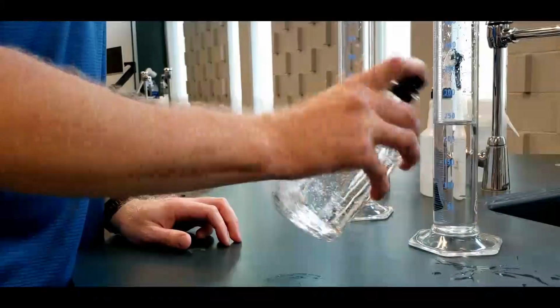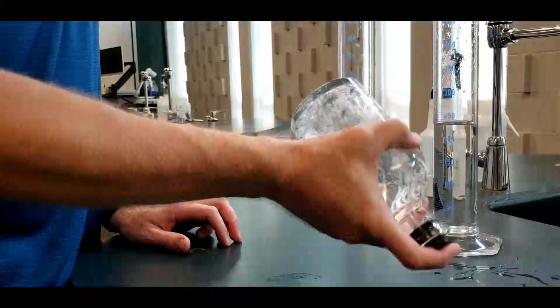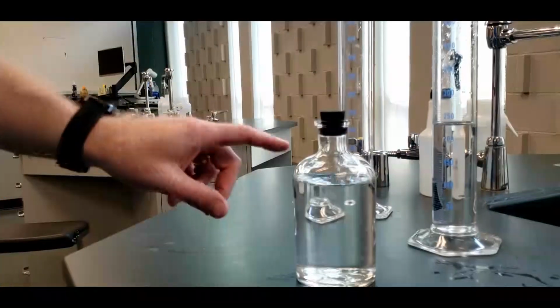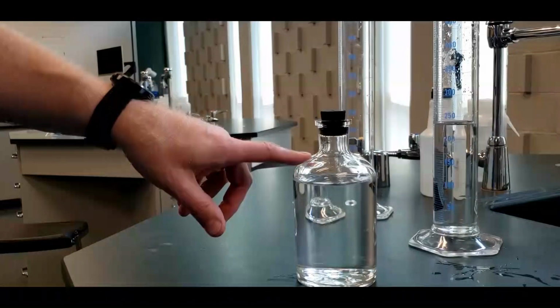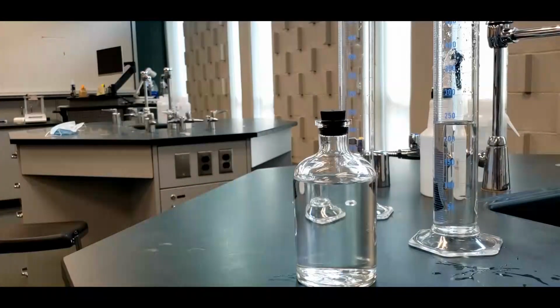You don't shake it like a bartender shaking up a drink here. You just need to mix it. That should about do it, and that should be perfect. And this is going to be what we're going to use for all the titrations that we do in this lab. We're going to do 12 of them. So this is our approximately 0.1 molar sodium hydroxide, and I'm going to label that later.